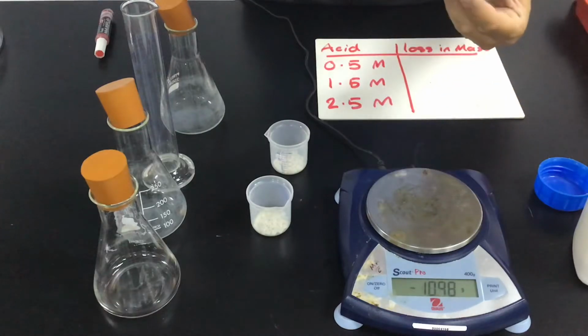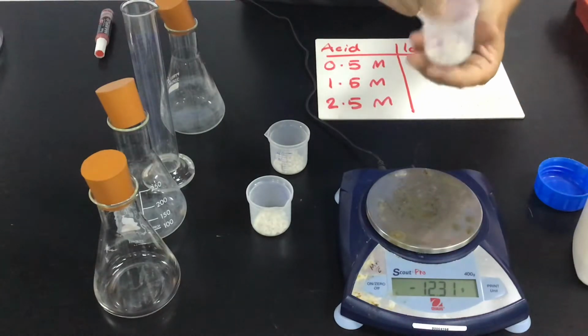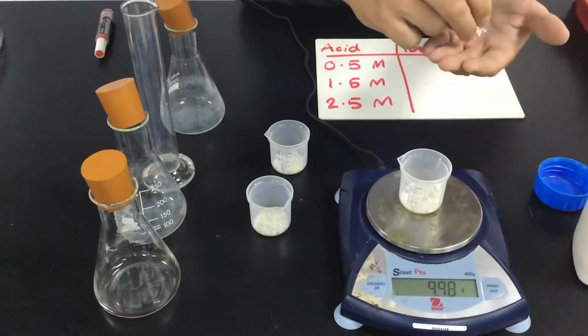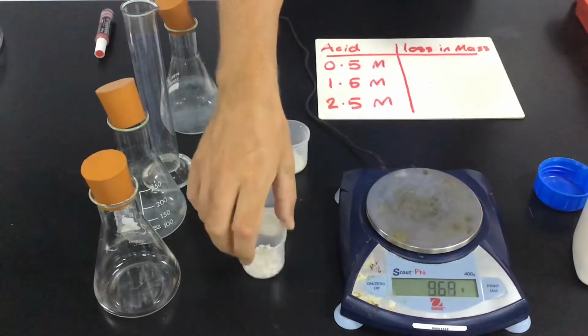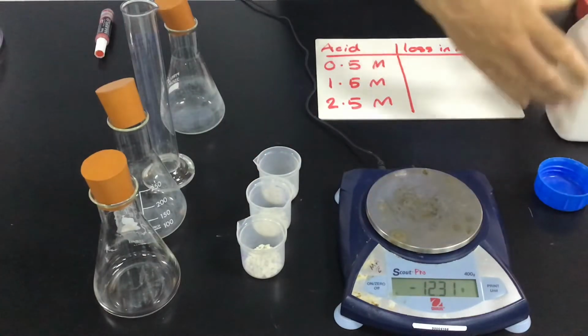So we can take a tiny bit out. 9.98. 10.01, perfect. So they are all approximately 10 grams of marble chips.